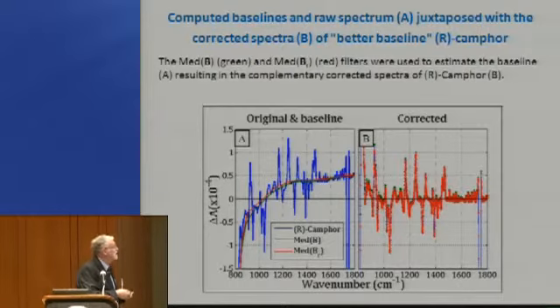Here is the spectrum as received. Here are the two baselines corrected with the two different matrices, and the result is very similar. Basically, it doesn't really matter which one you use, and it gets over the carbonyl artifact on here, just basically the spike in this particular case, but has a little difficulty at the very end of the spectrum.